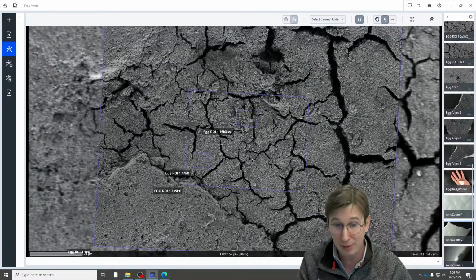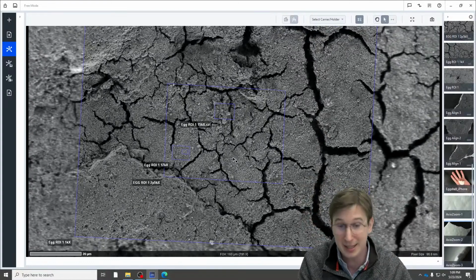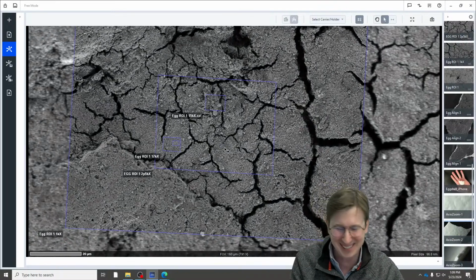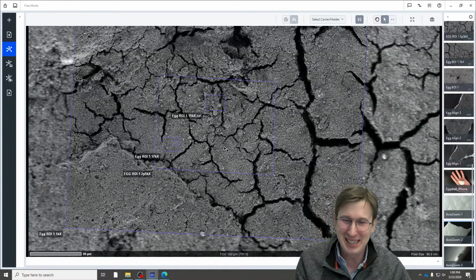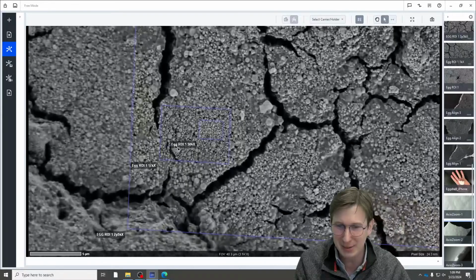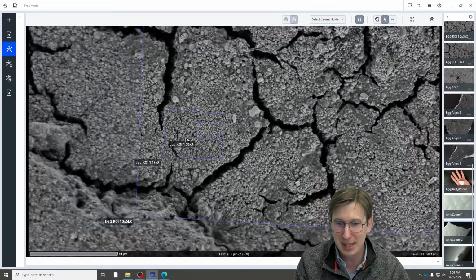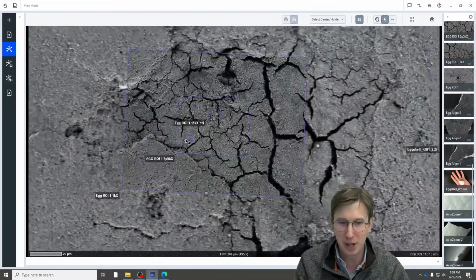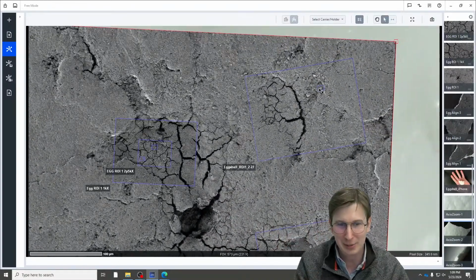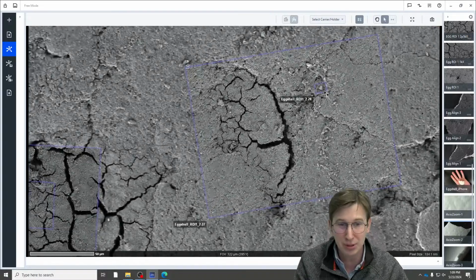Now, reading through some of the papers, in the cuticle here, the proper term at least according to that paper, I couldn't find a more recent one. If there are any egg experts out there, I want to say eggsperts, from the paper I was reading, it's not clear exactly why they have this structure. One idea was that it somehow made it more difficult for pathogens to hold onto. Obviously, I think it gives it a little bit of resistance as well, maybe so they're not so smooth.